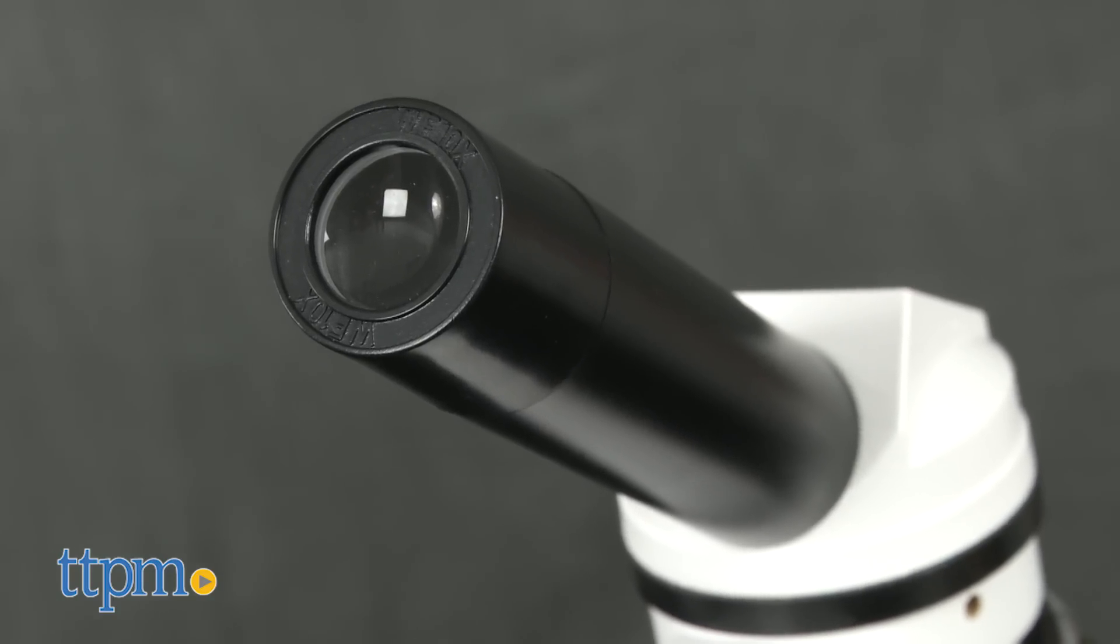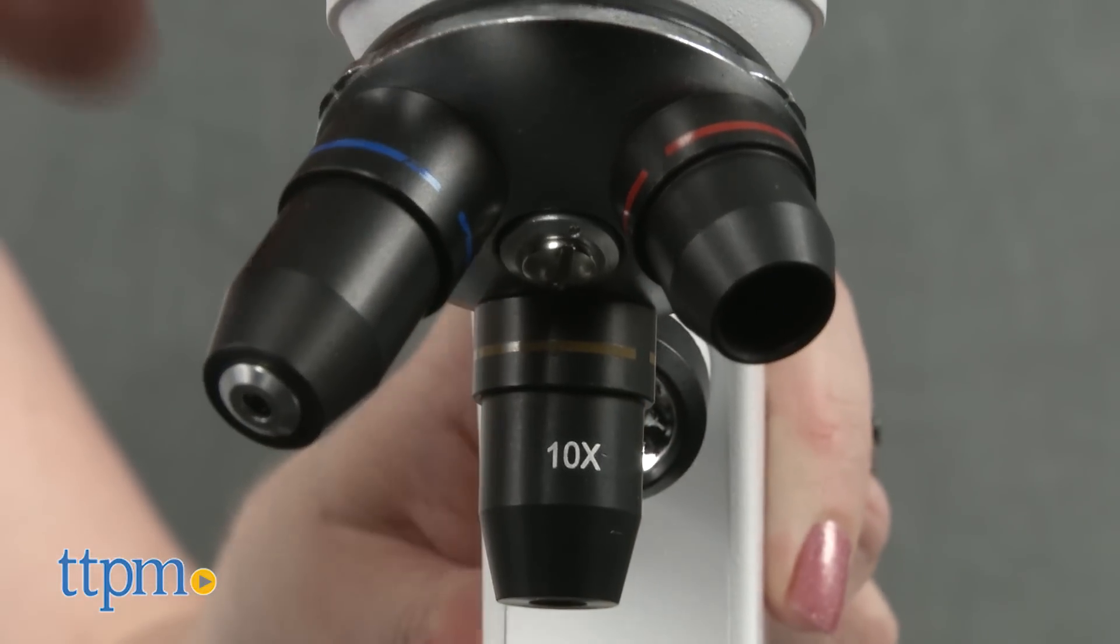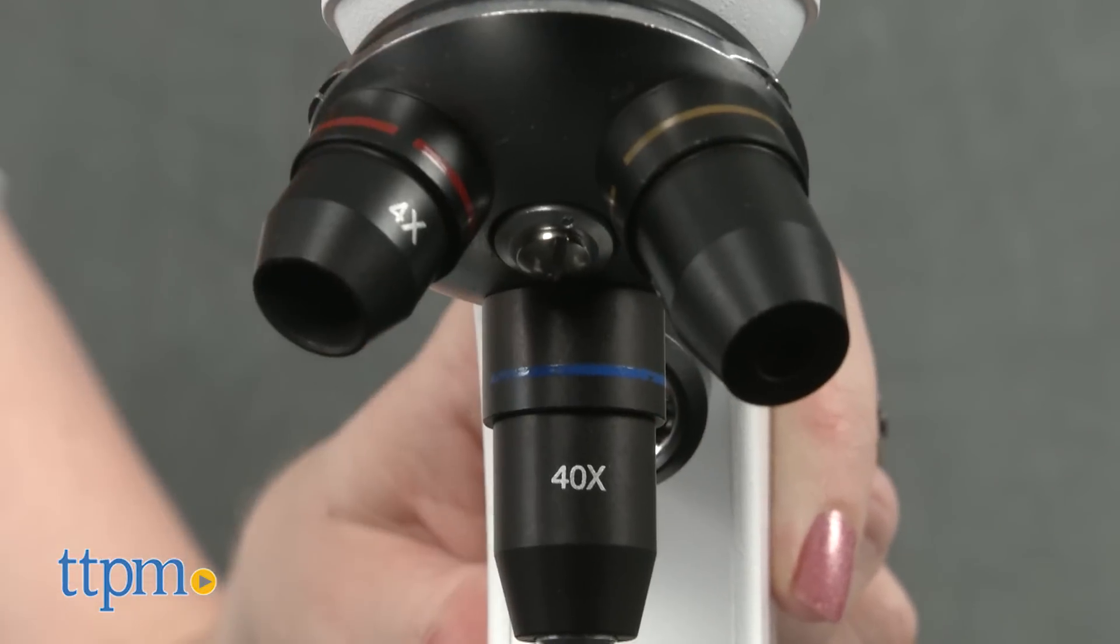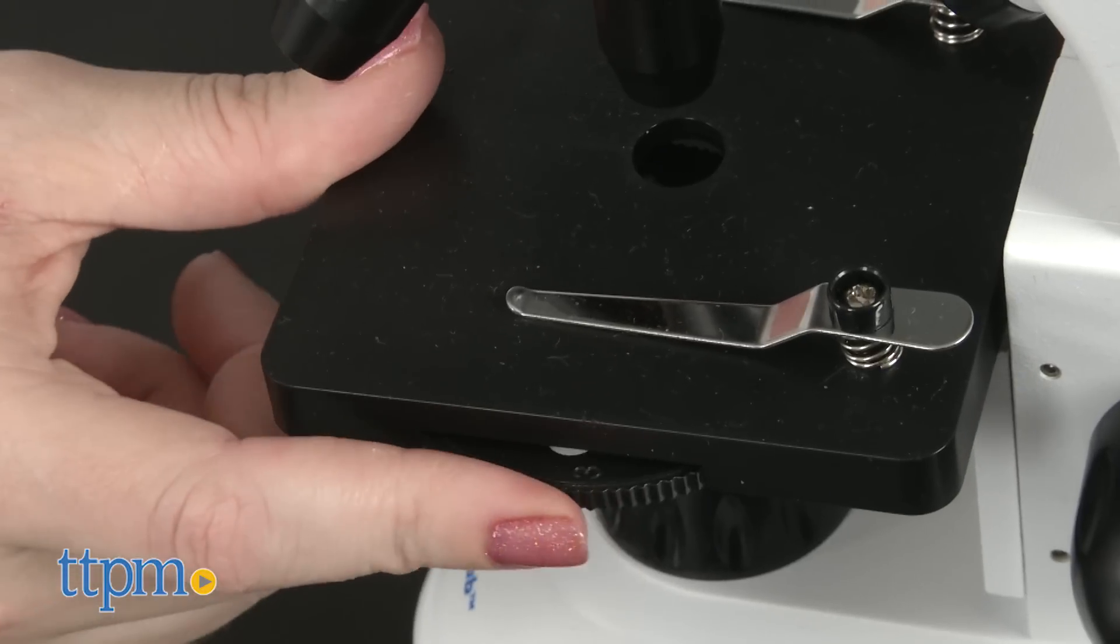The microscope has a 10x eyepiece, 4x, 10x, and 40x objectives, real optical glass lenses, dual focusing knobs, and a 6-hole disc diaphragm.